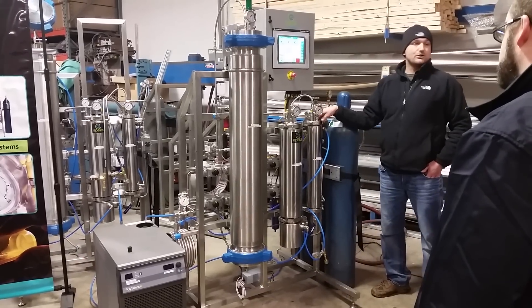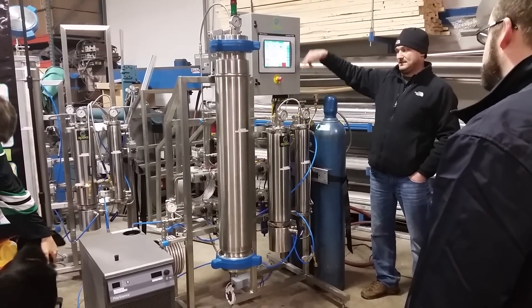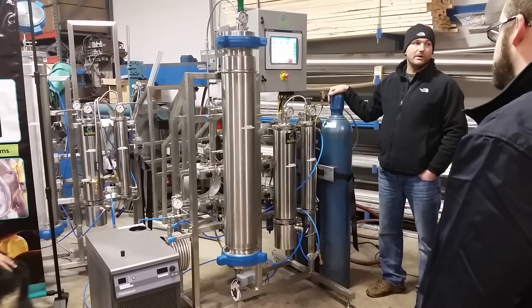We then run it through one more separator to make sure we get all the oil out before we send it back to the pump. It sits there and does that for 8 to 10 hours. Then we put the CO2 back in the bottles.